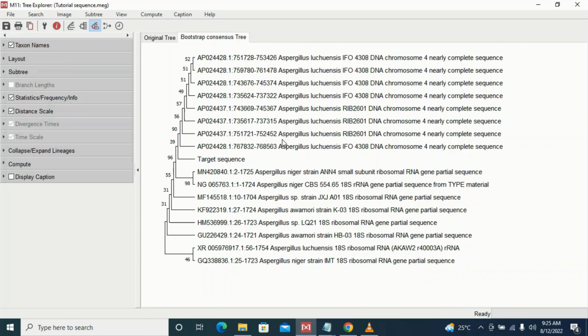So this is what I have. Remember, you cannot edit the write-up of this particular file or this result here. Maybe one of the organism names is too long, or you want to reduce it. You can't edit that here. Rather, you have to do that in the Notepad file, before you convert it to a FASTA sequence.